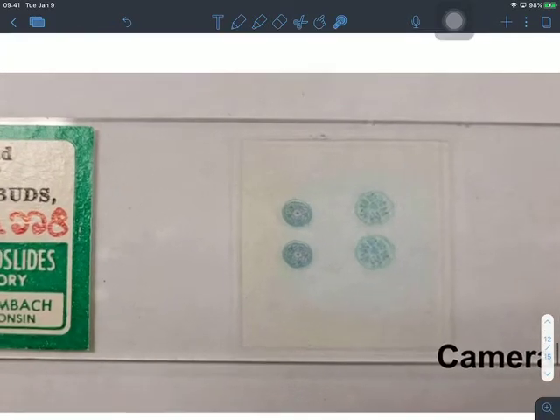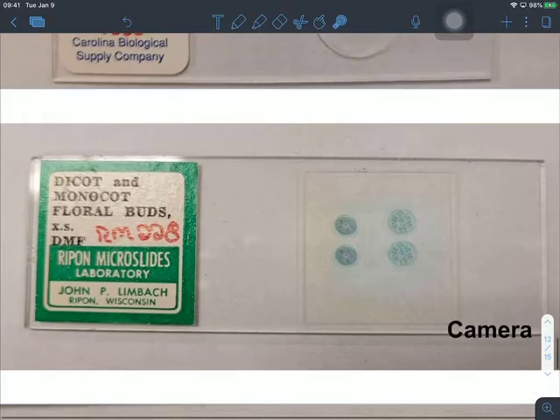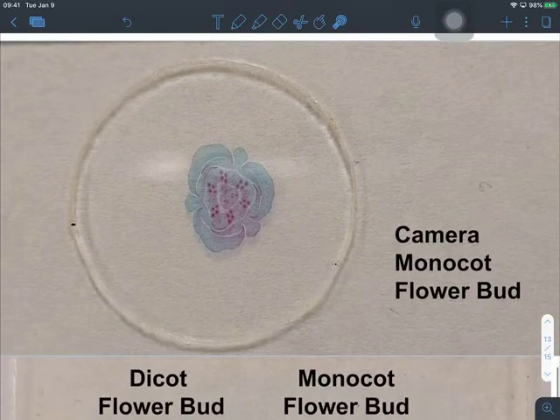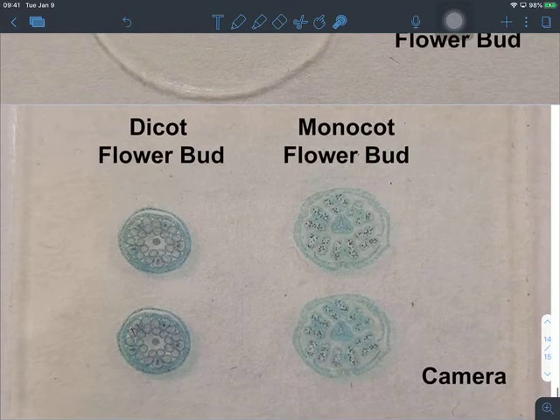But if you zoom in, you can see again that the dicots on the left, monocot on the right for this comparison of our two different tissues. Zooming in, beautiful parts of 3s and 6, and zooming in, beautiful sets of 4s and 5 for our dicots.